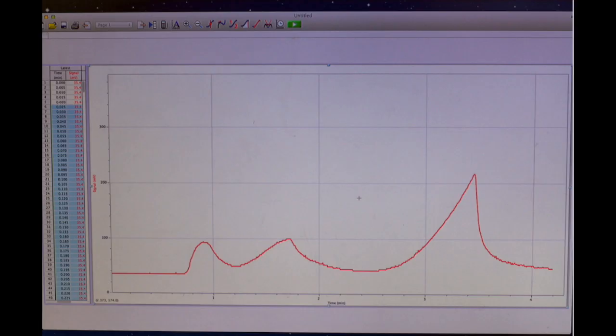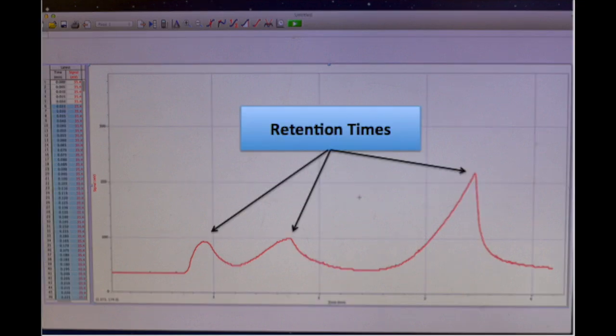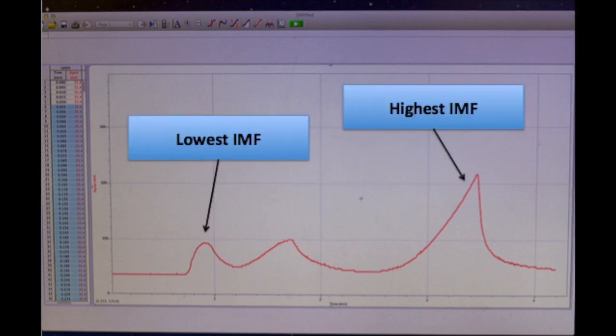Click Store Run under the Experimental menu, click Collect, and verify the temperature parameters. We can examine our data while the GC prepares for the next injection. At the top of each peak is the retention time, or the amount of time it took for the compound to elute. Generally, compounds with strong intermolecular forces, or high boiling points, elute slower and thus have a larger retention time.